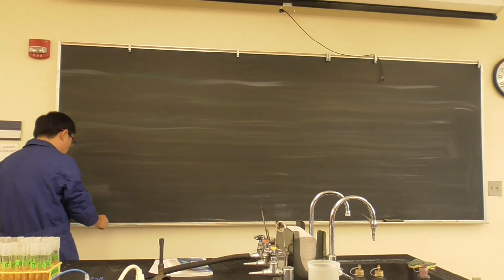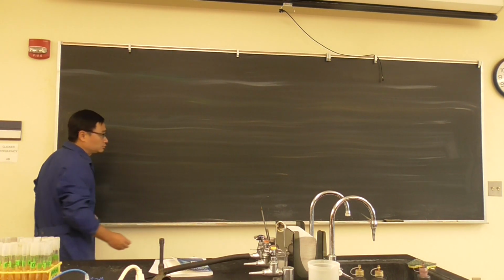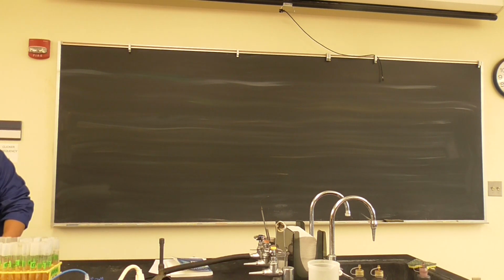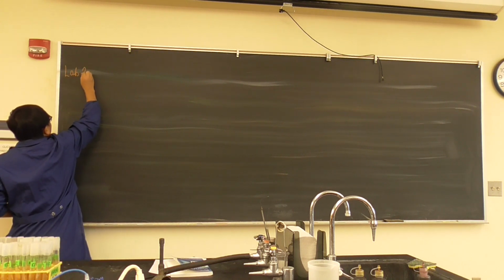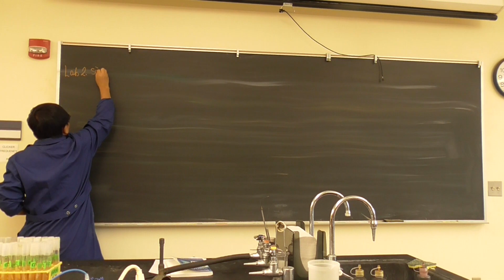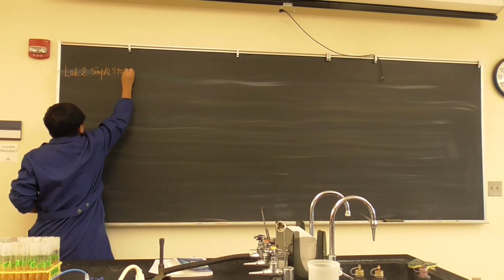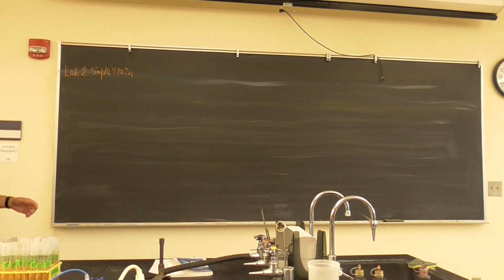Okay, so again, I'll give about 20 minutes of opening remarks, and then you go ahead and do it. The TA will help you, and I'm also going to show you how to do it. So this is going to be lab 2. We'll talk about the simple stain. So this moves to the staining technology.